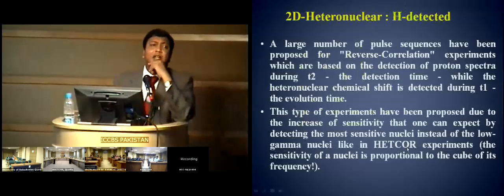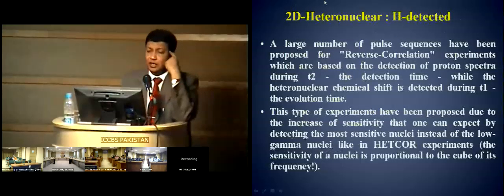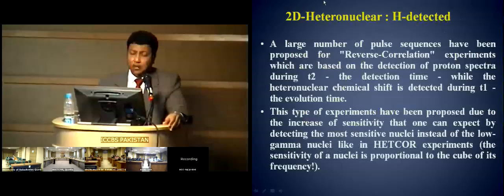Then the second thing which I started to discuss with you was H1 detected heteronuclear NMR spectroscopy.